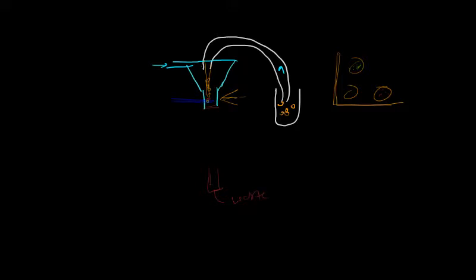So basically the cells form a stream, and I'm talking about a stream-in-air kind of sorter today. It's called stream in air. That means a stream is generated and it comes into the air. Most of the high-speed sorters are actually stream-in-air based sorters.